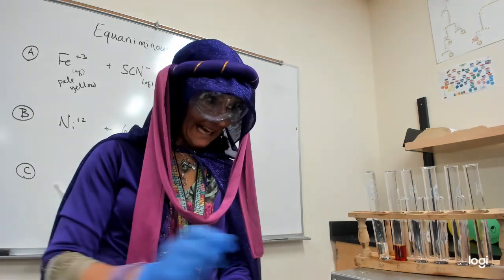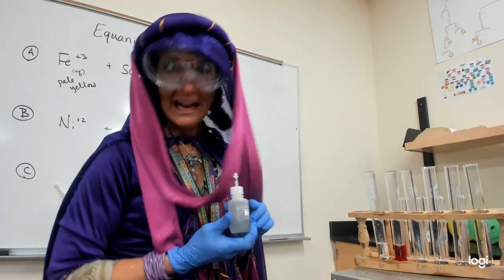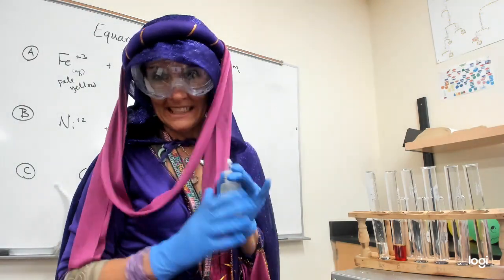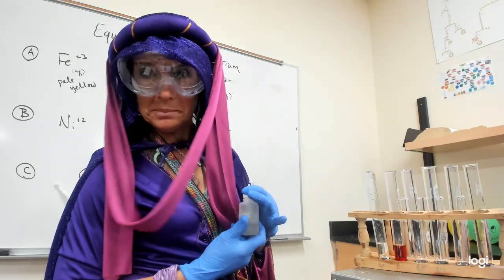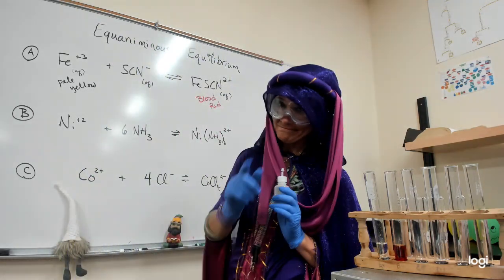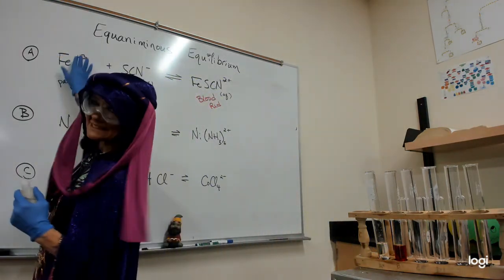So now what I'm going to add is some sodium hydroxide. Let's see if this works. Worked for the guy in the video. I've never tried it before. So the sodium doesn't matter. The sodium's a 1A. It's a forever ion. It loves being aqueous. It just keeps swimming. But the hydroxide, if we're lucky, the hydroxide should bind to the iron ion.